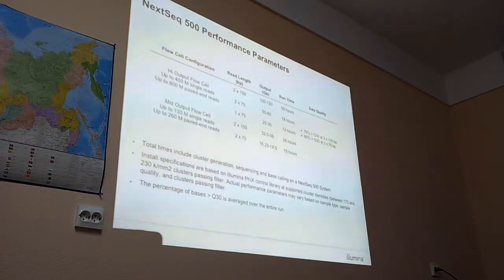So in general, if you do enrichment or exome, which is also a type of enrichment, it's always 2 times 150 cycles. If you work with amplicons, it can be smaller, depending on the size of the amplicon. For RNA, what we recommend as a standard is paired and 75 cycles. In some cases, it's even enough to do single with 75 cycles. These are just some examples.